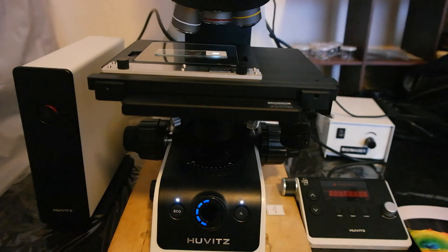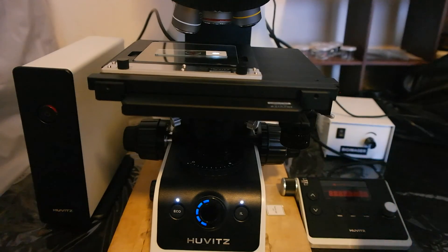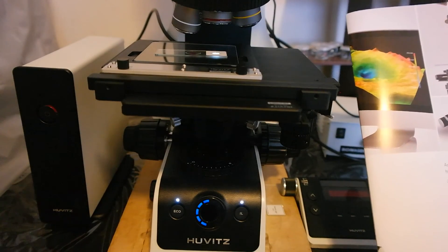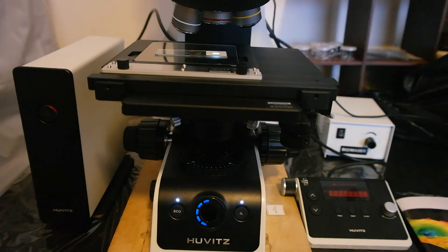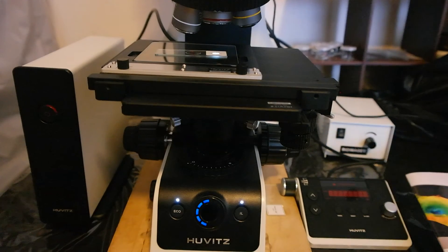On top of that we offer a great 3D profiler with this microscope. It comes with amazing resolution of 0.01 micron or 10 nanometer, which has a great stroke of 30 millimeter.